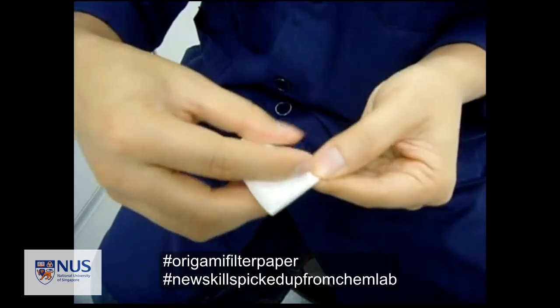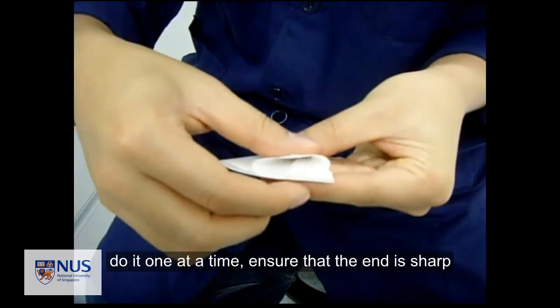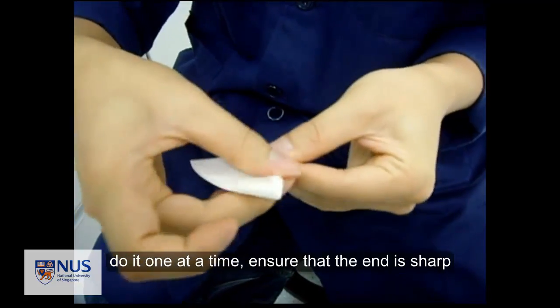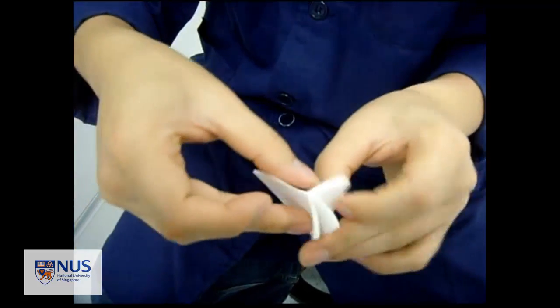It's like folding origami — interesting, right? Do it one at a time. Fold it. You should have a cone shape at every step.